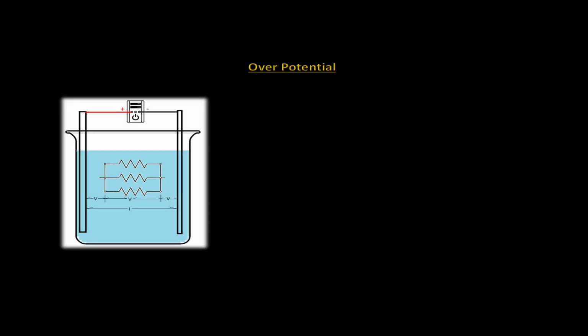Within the solution, there is a flow of electrons from the negative side of the power supply towards the positive side of the power supply. At the same time, there is a migration of positive ions flowing to the negative cathode, while the negative ions flow towards the positive anode. An excess of negative ions are derived from the solution and the salt bridge if one is present.